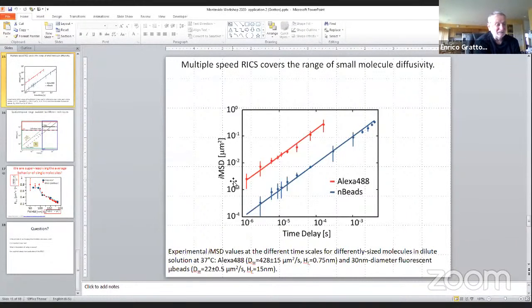And you say that this is like, I will call that a nano camera, which is okay. In fact, in that case, the frame rate is 1,000,000 frames per second. So yes, at 1,000,000 frames per second, you are here, and you can measure that distance, and you can measure that very well. But you have to go to a different kind of camera and use the camera in a different way.